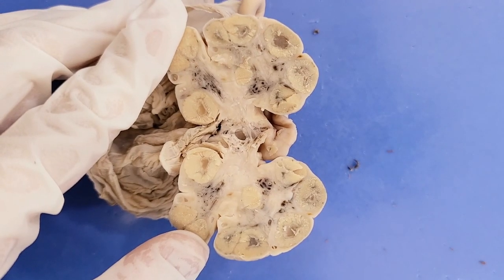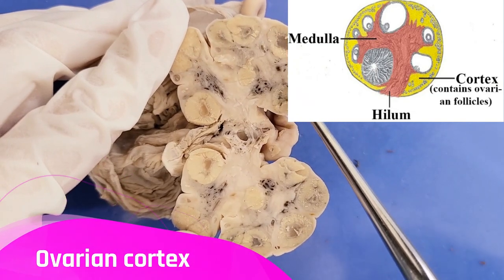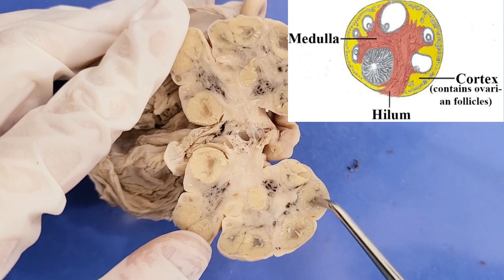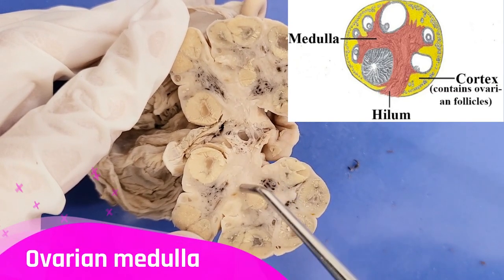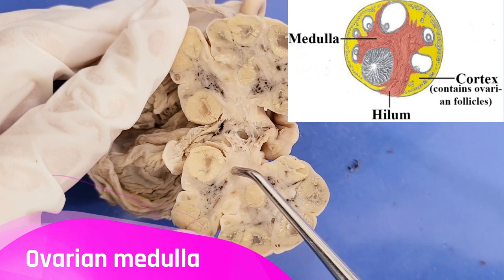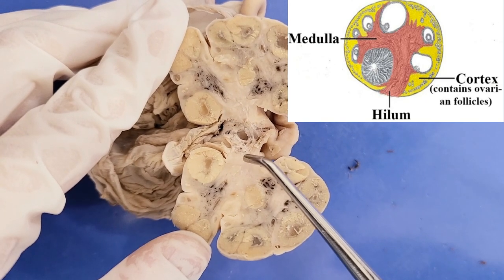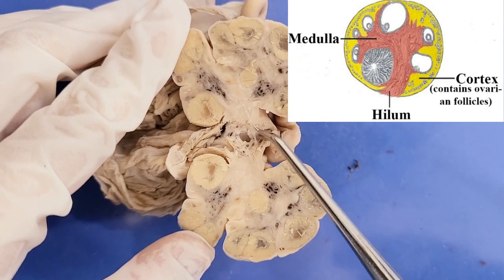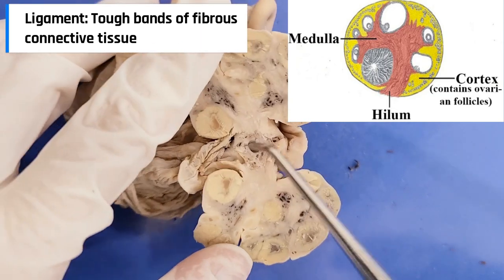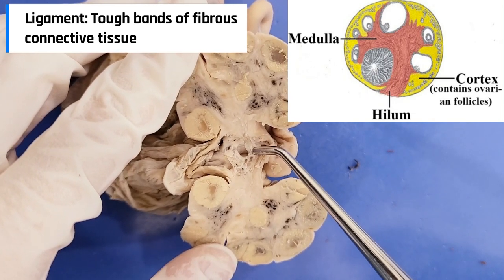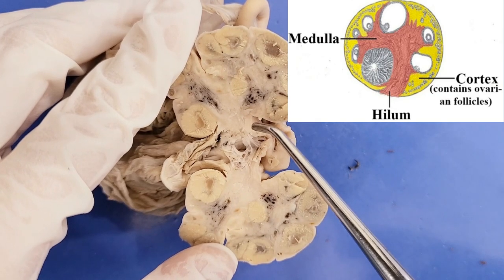The outer layer of the ovary is called the cortex, which contains the follicles that we'll talk about soon. The inner layer is called the medulla, and it's mostly neurovascular, meaning it contains nerves and blood vessels. At the very end is the hilum, which is the site of a ligament that connects the ovary with the uterus. The hilum also serves as the entry point for blood vessels.